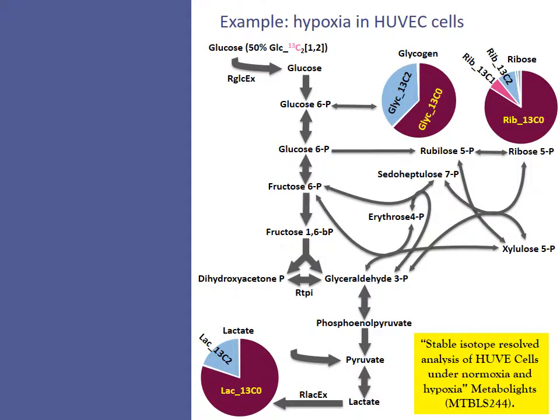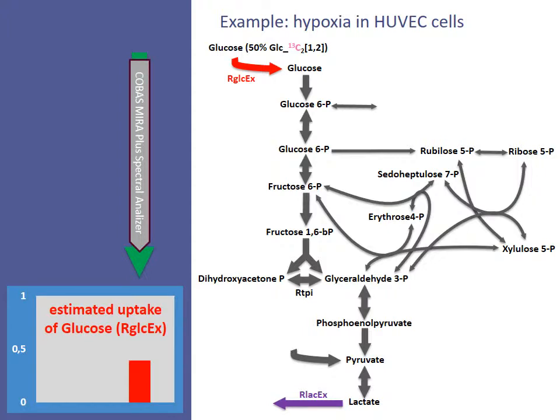Following an independent methodology, based on the measure of initial and final concentrations of glucose and lactate, we have estimated a value around 0.45 glucoses consumed per lactate produced, which is the expected for a cell under hypoxia.